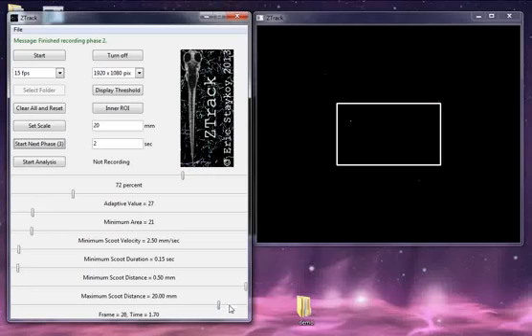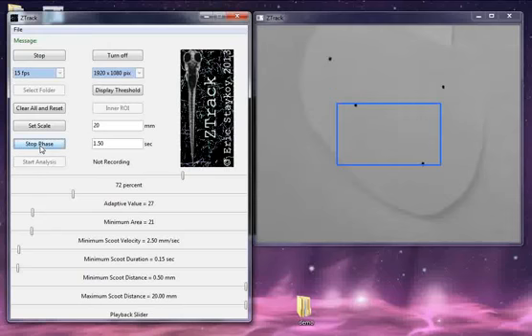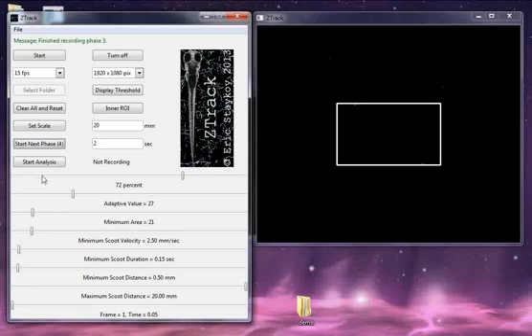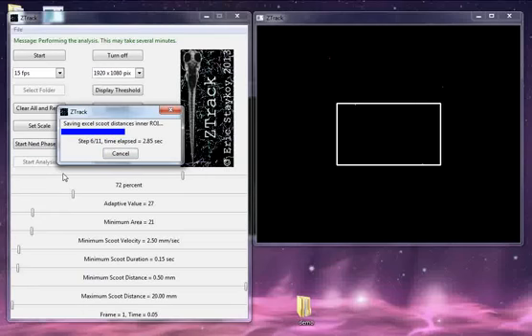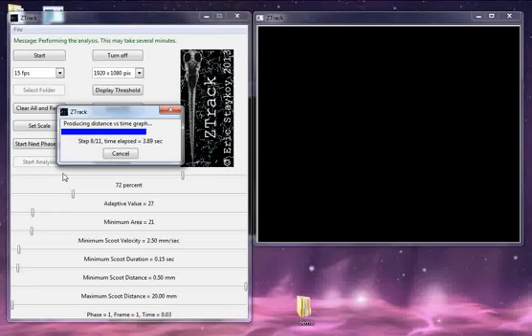And if you look closely, you can see that the dots inside are green and the dots outside are red. So we're just going to start the next phase. You can do as many phases as you want, and they can be any lengths of time that you want them to be. So you can make them 2 hours, for example. I've done that before. And I just press Start Analysis, so this will analyze all of the data that the program has collected so far.